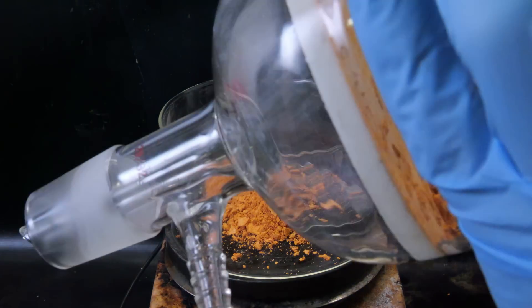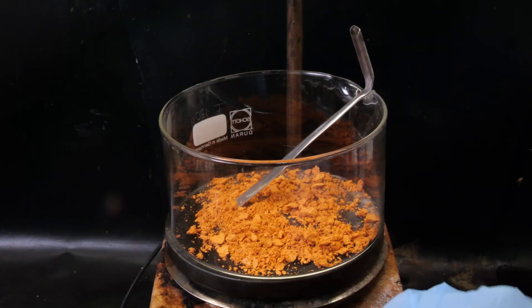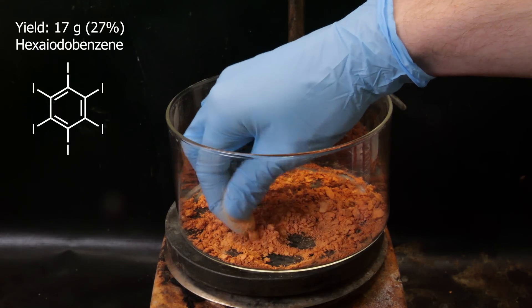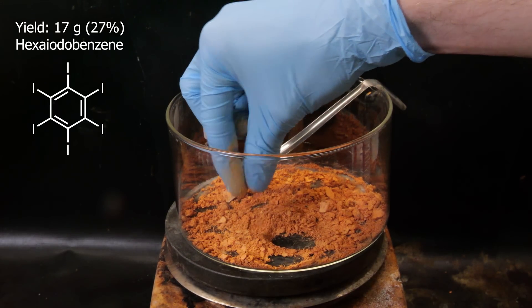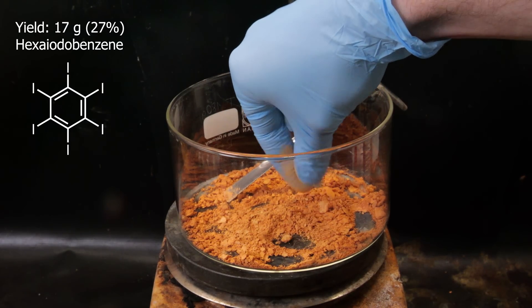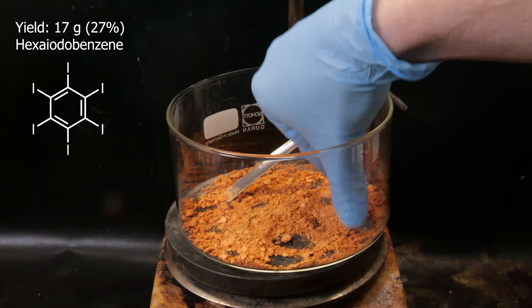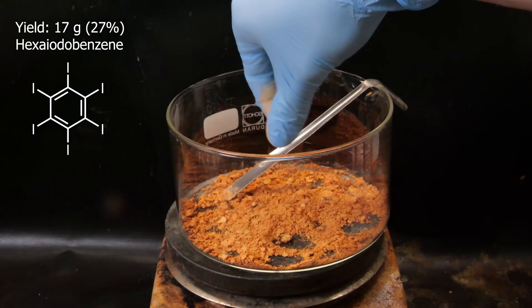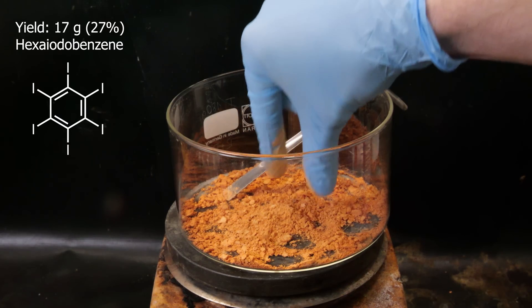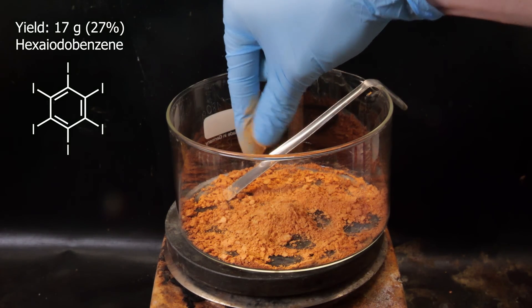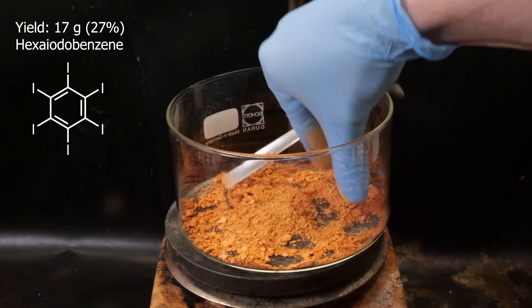Afterward, I move it to a dish that I heat to 100C and allow it to dry, giving about 17 grams of hexaiodobenzene. However, I want to clean it up even more to be sure it's pure. Since hexaiodobenzene is pretty much unreactive, especially towards oxidizers, it would be unaffected by piranha solution.